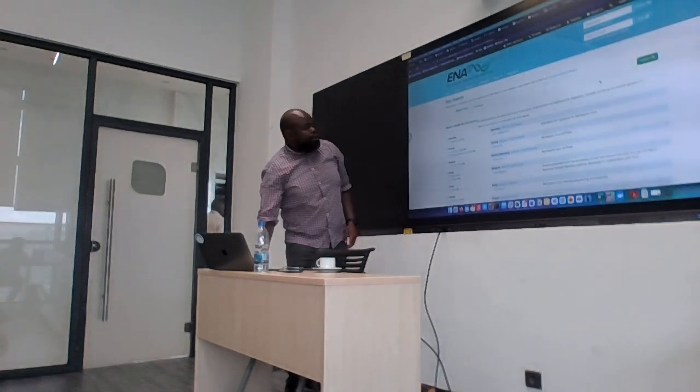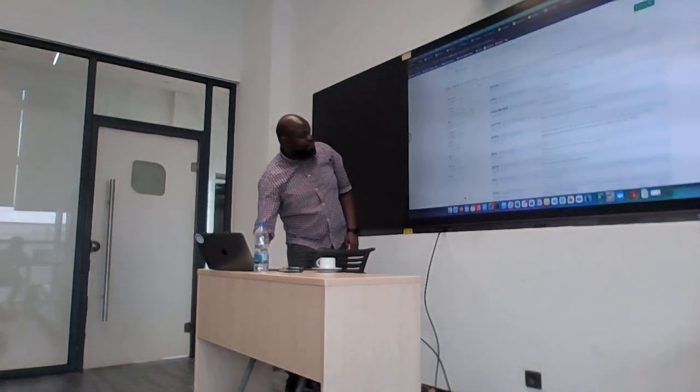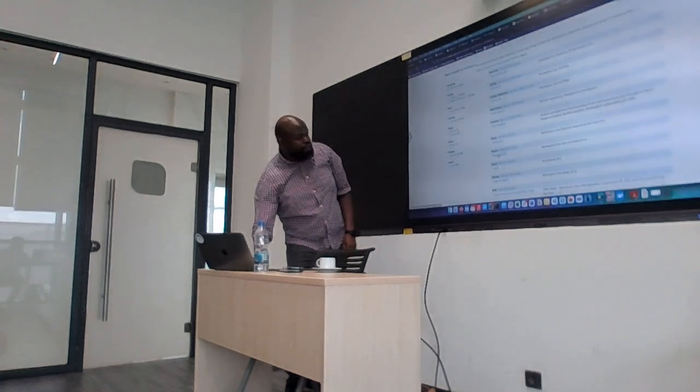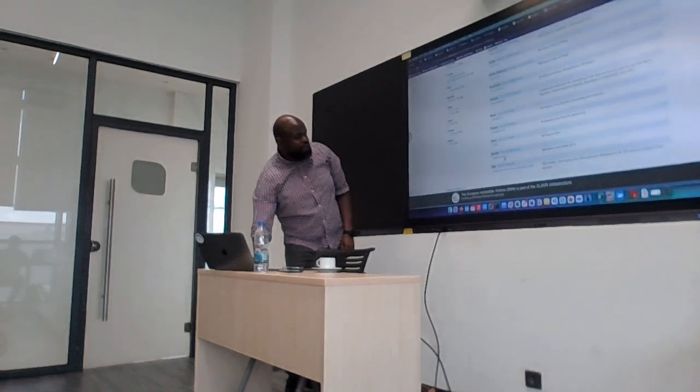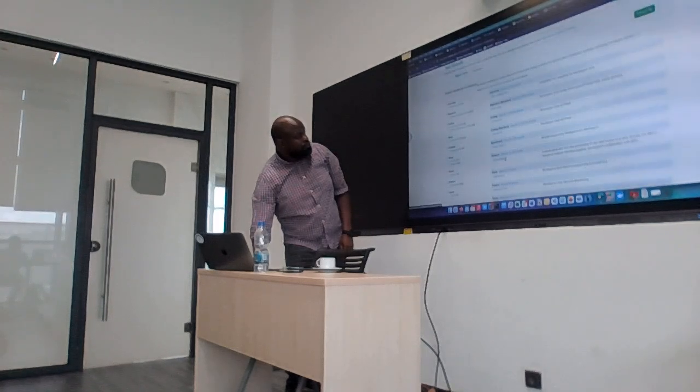All right. Okay. So this will still give you assemblies and other things, but often I'm interested in the reads, so you can look for specific projects, and look for specific samples.